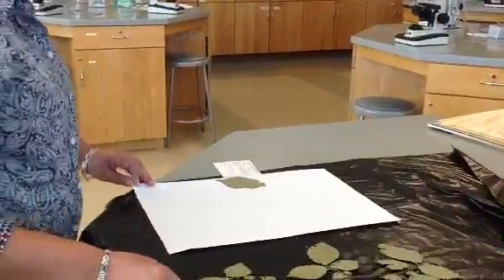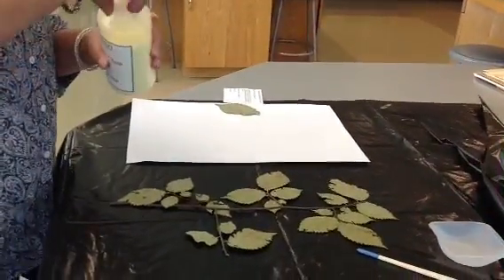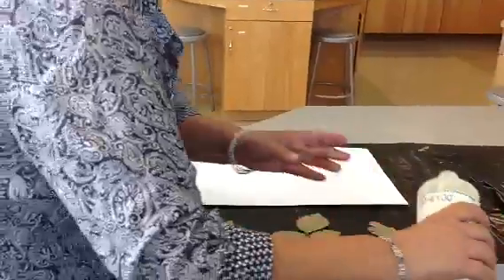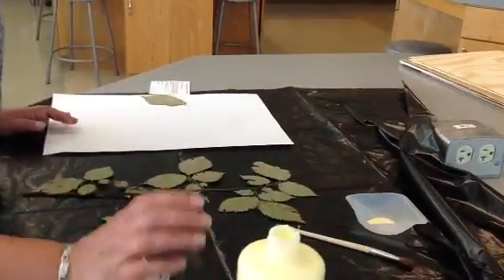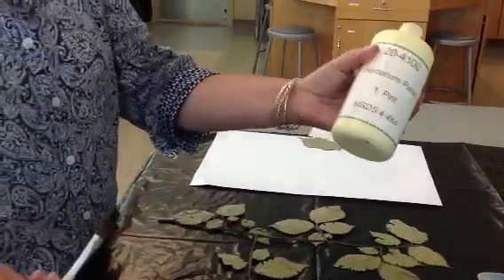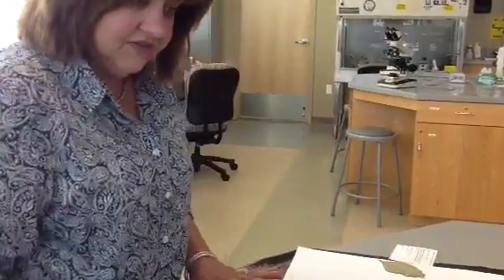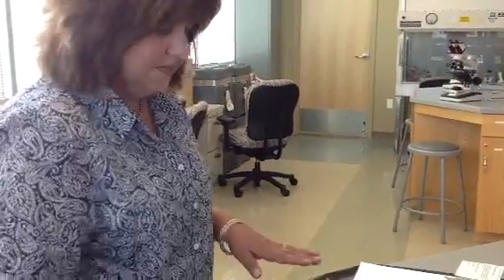I'll begin by taking a little bit of herbarium glue. The lid was stopped up, so I'm just putting a little bit into the container. I think this stuff looks to be the same as Elmer's Carpenter's Glue — it's this yellow color. I don't think there's any difference. I've also covered my table with a plastic drop cloth so that I'm not going to mess up my table.